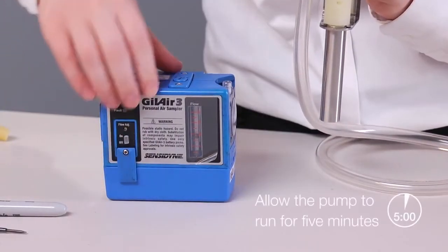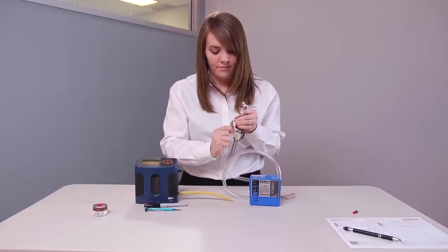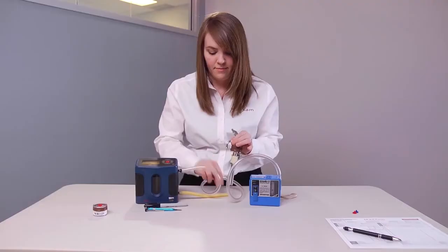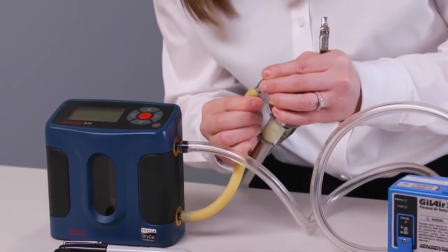Now let's go through the calibration procedure. Allow the pump to run for about 5 minutes before you start. Disconnect the flexible tubing from the cyclone and connect it to the calibrator's outlet port. Using another short piece of flexible tubing, connect the cyclone to the inlet port of the calibrator.